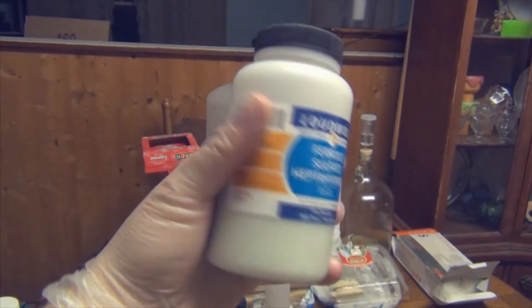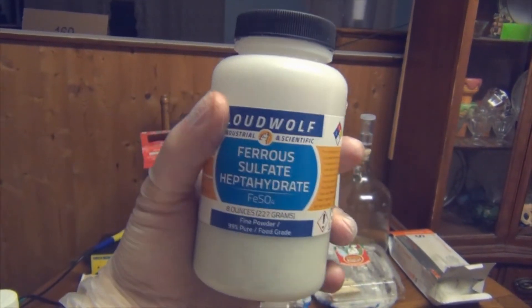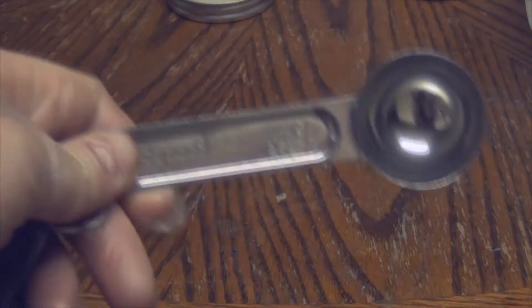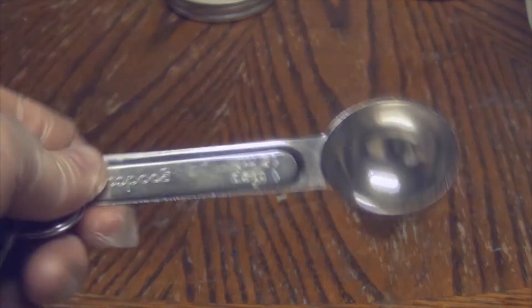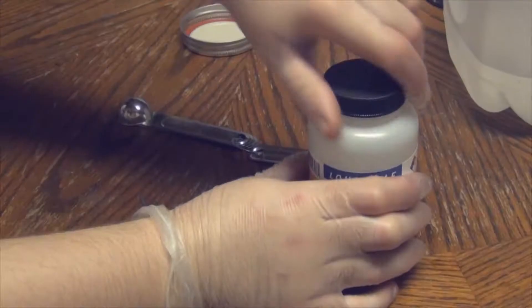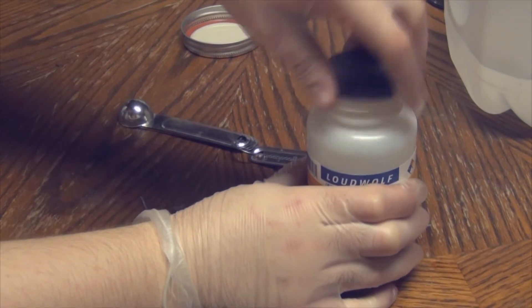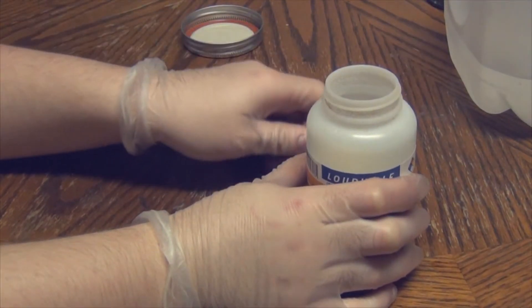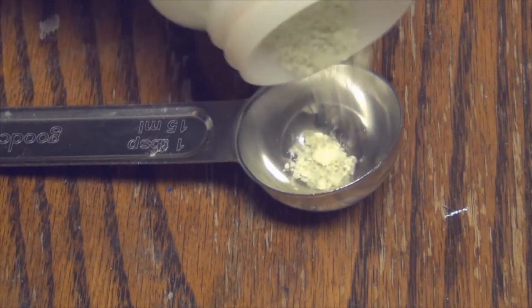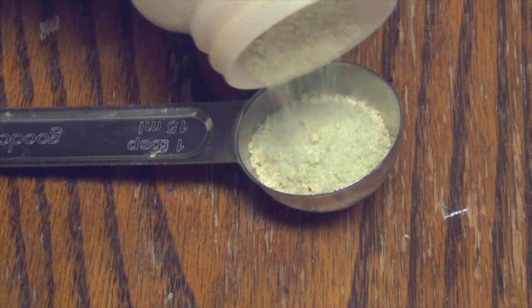Next, get your ferrous sulfate. To measure everything I'm using a tablespoon, which is about 15 milliliters generally. If you want to be more exact, you're welcome to use a scale. Pour the ferrous sulfate into the spoon and mix it into the solution. This is about 15 grams, give or take.